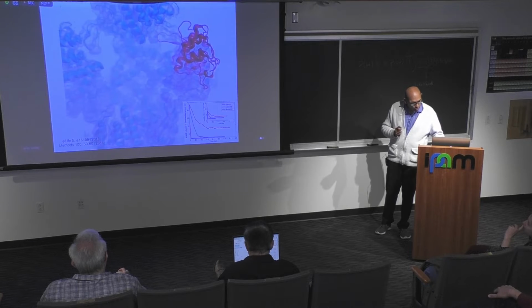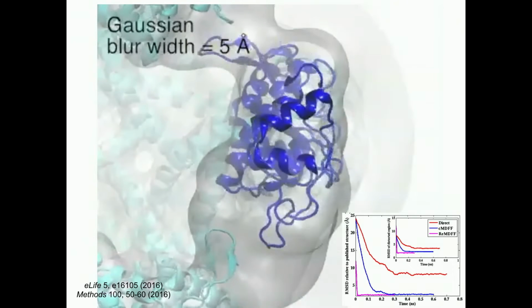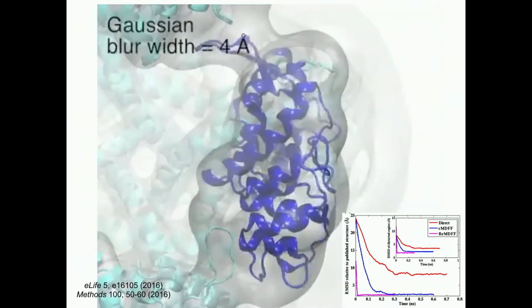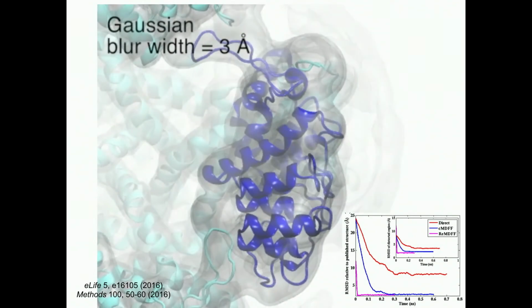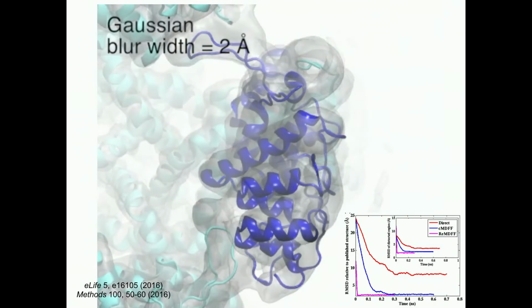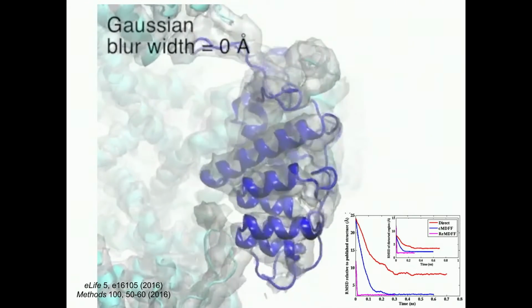So then in order to address that, we came up with an idea from molecular dynamics, which is traditionally called simulated annealing. So you take this density and you low pass filter it and then gradually increase its resolution. So therefore, you basically start with a smoother surface and then gradually dig deeper and make the surface more and more, introduce more features in this. That overcame this problem. This is of course showing simulated annealing.